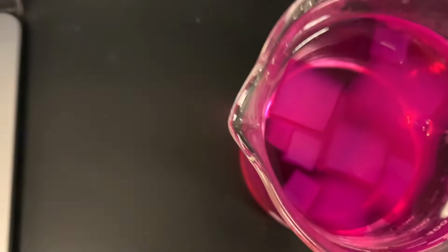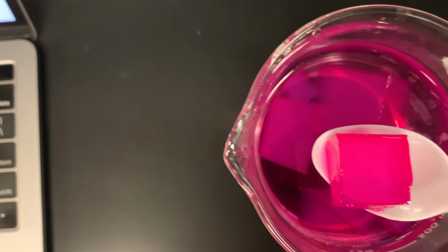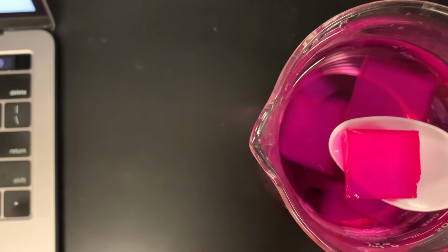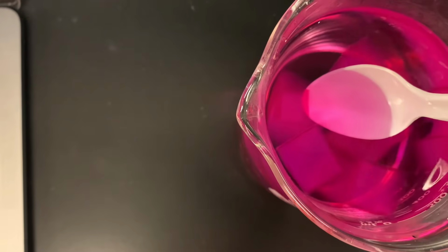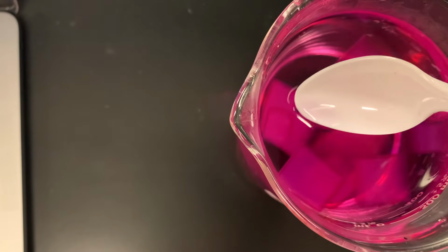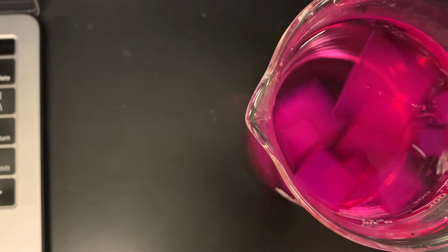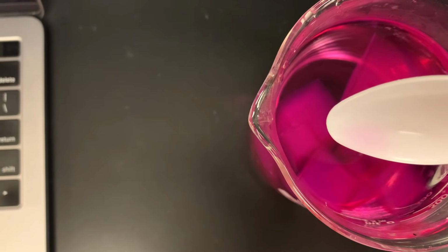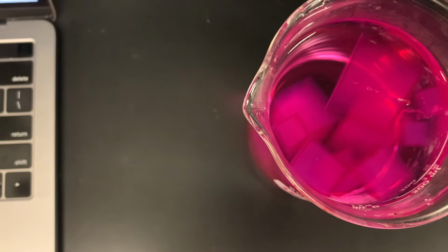Now, if we look closely, you guys can notice that, let me pull one out here real quick. All right, they look pretty pink on the outside, all right? But if we look really closely, we can see that the inside of them, even this guy right here, he's a good one. But you can see on the inside, it's not as pink as the outside. The outside is all pink, and you can see it's slowly becoming more like translucent going in. In the middle is still not so translucent yet.